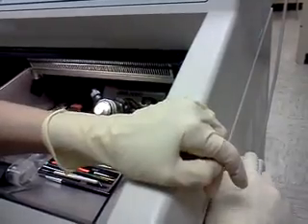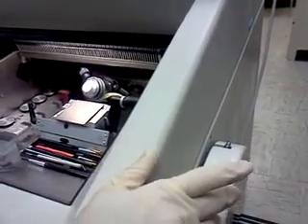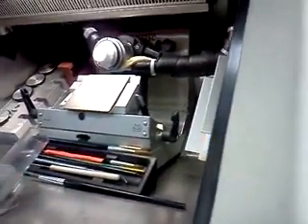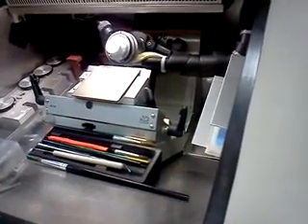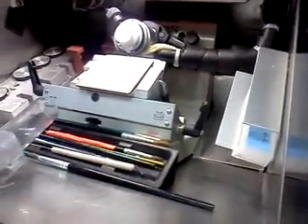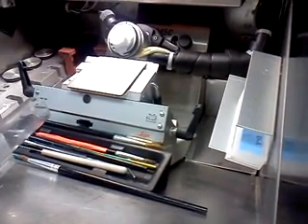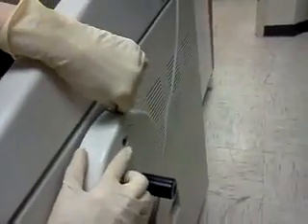This is wrong. So, let's lock the and then try. There it goes. This needs to be locked for that to work. Is it going back? Can you hear it? Yeah. Okay, now if I want to stop it, I just hit that.